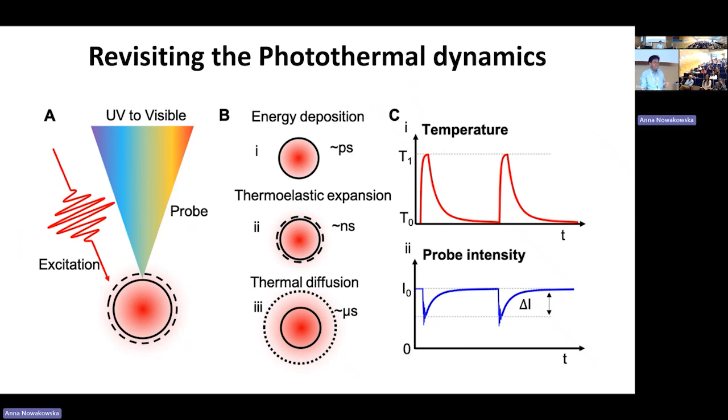So in this sense, fundamentally, photothermal is much more sensitive than photoacoustic because we measure all the energy, right? But the ultrasound experiences much less scattering, so that we can use photoacoustic to do deep tissue imaging. And the photothermal can measure very small features because we use the probe directly at the focus.